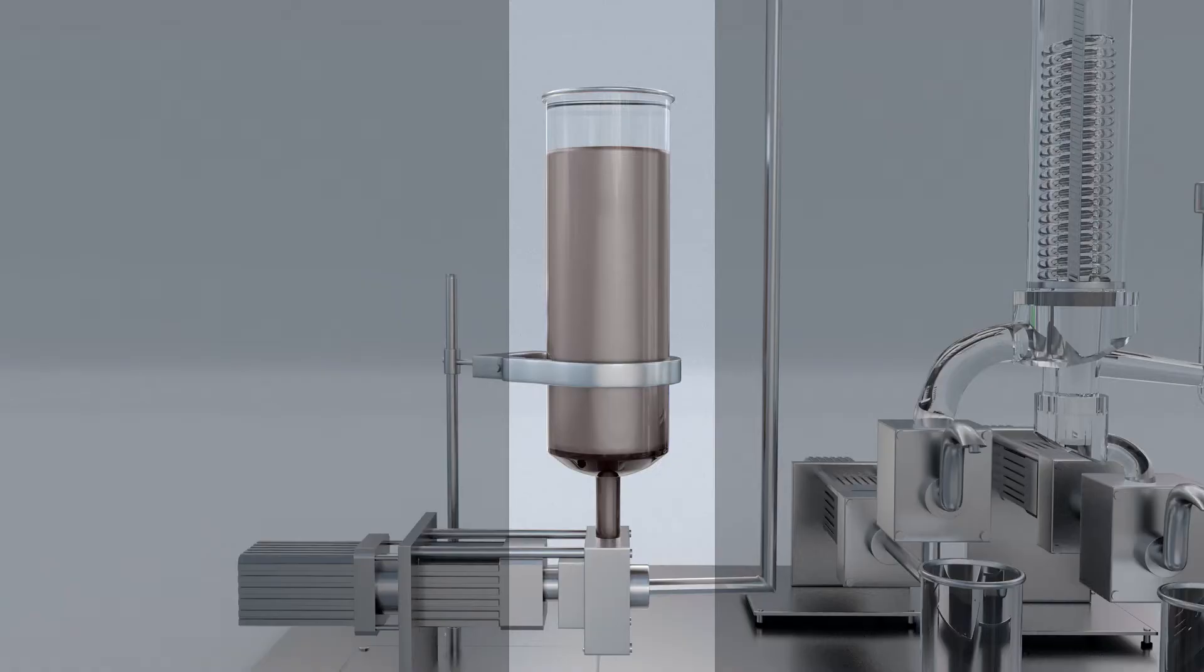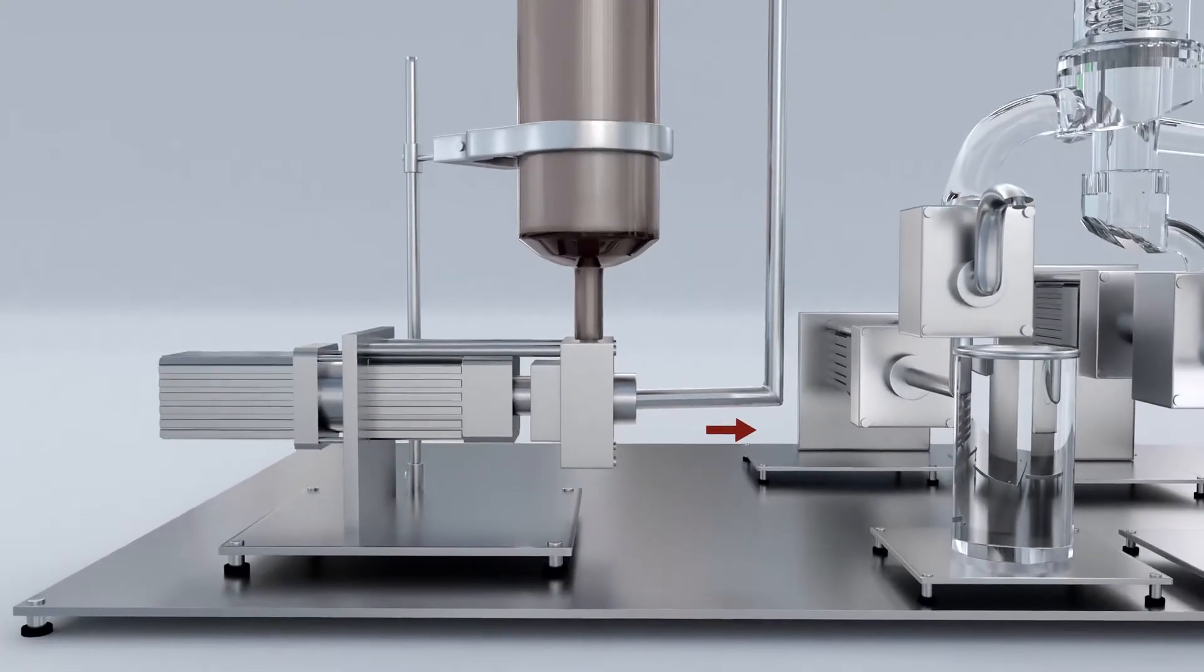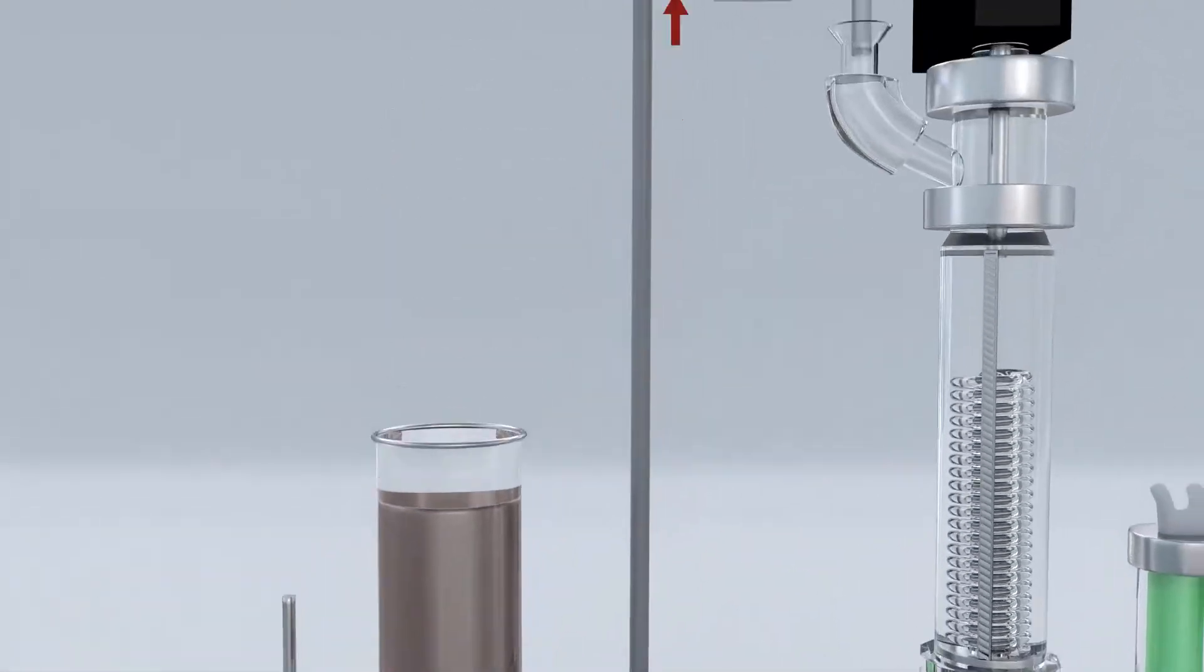Because crude oil is very viscous at room temperature, it is first warmed to a liquid state in the feed tank. This oil is then pumped up through the feed tube into the main evaporation chamber.